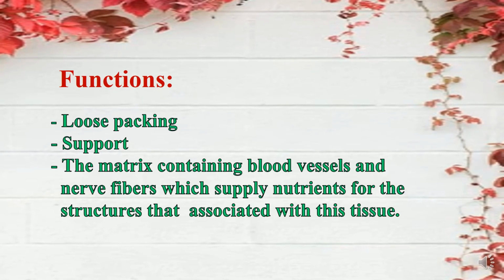The functions of loose connective tissue are loose packing, support, the matrix of loose connective tissue containing blood vessels and nerve fibers, will supply the nutrients for the tissues or structure that usually associated with this tissue.